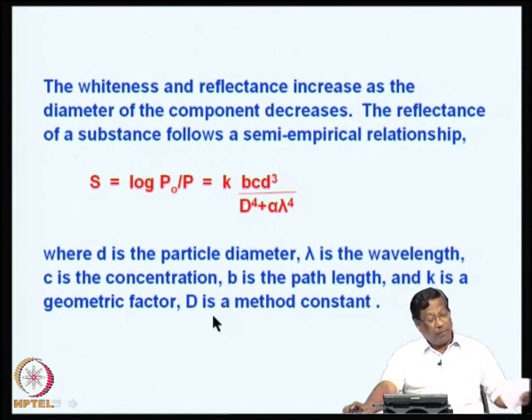So, this completes our studies on the spectrophotometer. In the next class, we will study what is fluorescence and phosphorescence. Now, in the instrumentation several aspects are common. So, we will be just describing the basic features of the instrument, and wherever there is a requirement, we will go into more detail.